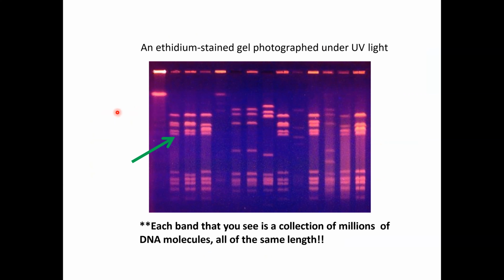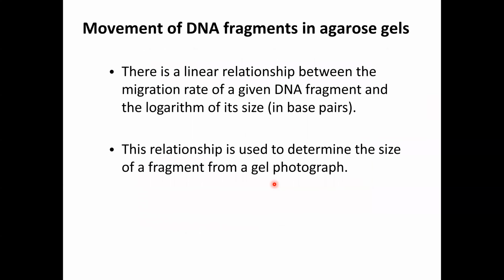But if you want to confirm it really, you could also use a nanodrop. A nanodrop is a measurement of your DNA fragments, no? So you could also use it to confirm, but for me, I always confirm this one. After gel electrophoresis, I measure the quantity using a nanodrop. It's really more accurate for me. But of course, you cannot do it without also performing the gel electrophoresis.